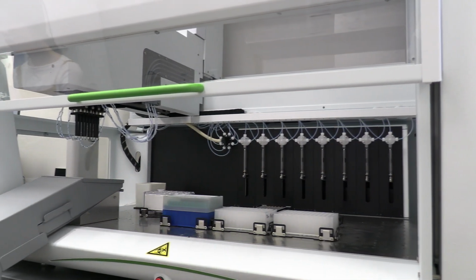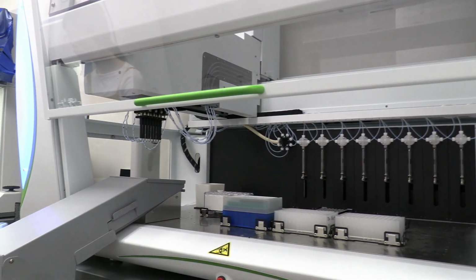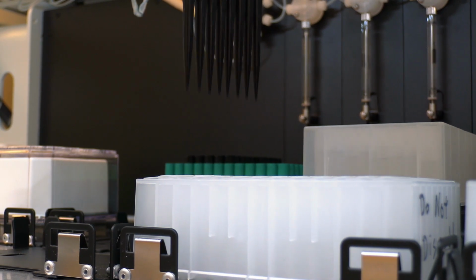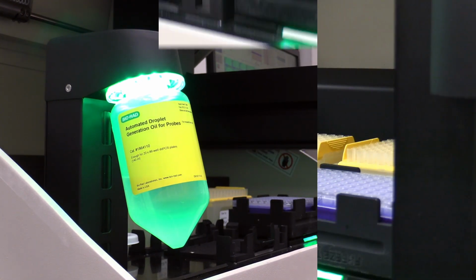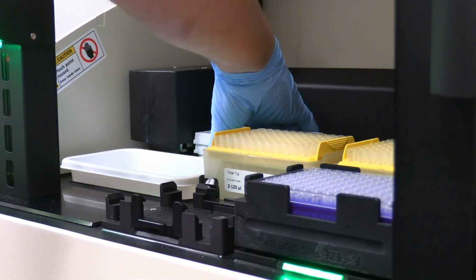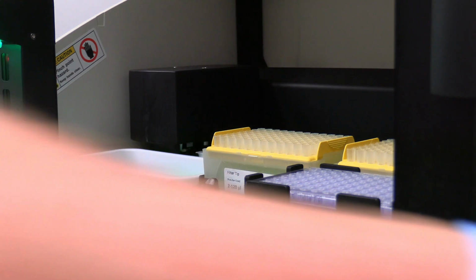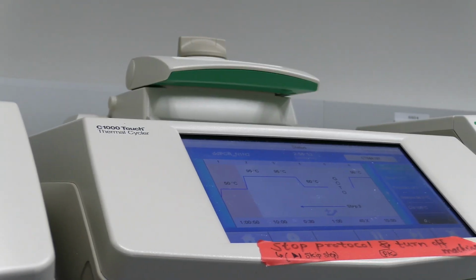Purified wastewater samples are transferred to PCR plates using an automated liquid handling workstation before being loaded into a droplet generator to form droplets. Each droplet functions the same as an individual test tube where the PCR reaction can take place.